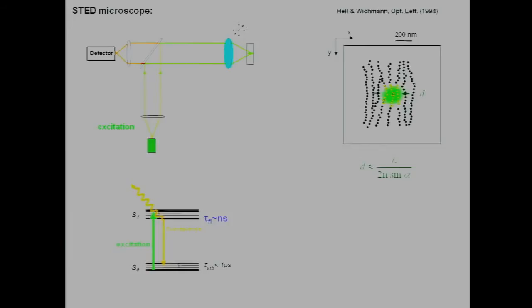We could say, okay, if we manage to reduce the signal here to the signal that is produced by the molecules here in the center, then, of course, we should be able to get a higher spatial resolution, because we could maybe separate them, since they're not giving the signal at the same time here in the detector, where it is not integrated. Then you have to ask yourself, is there any mechanism out there that would allow us to stop some of the molecules from emitting despite the fact that all of them are flooded at the same time by the excitation light? If you're trained as a physicist, then you know not only can you excite a dye, but you can de-excite a dye.